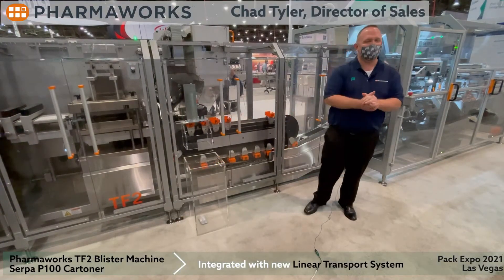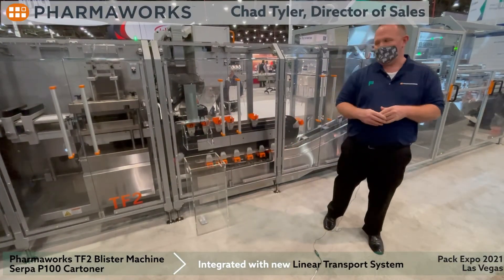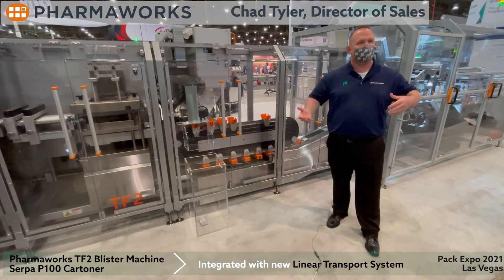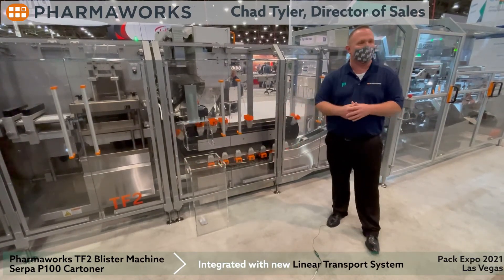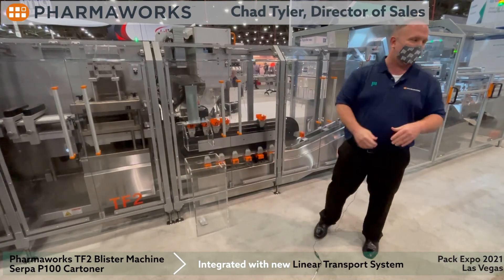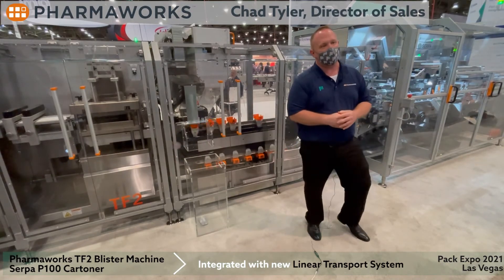All right. I hope you guys really enjoyed the video. Again, showing this really nice integrated solution — taking two asynchronous machines and syncing them up with the XTS conveyor by Beckhoff. It's a TF2 from PharmaWorks and a P100 Kartner from Serpa. Thank you.